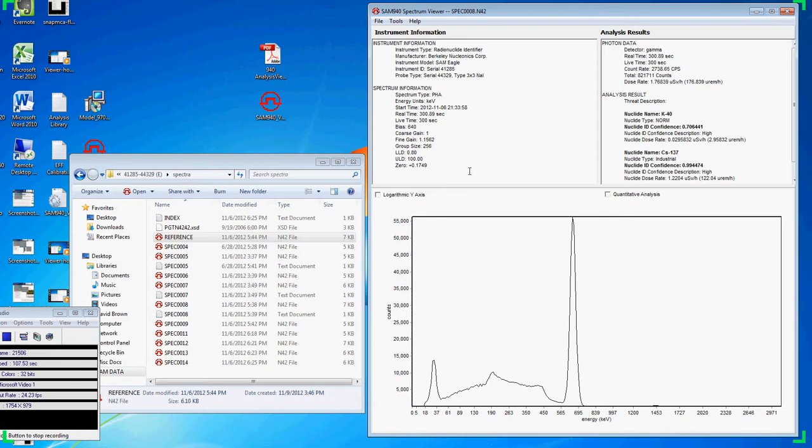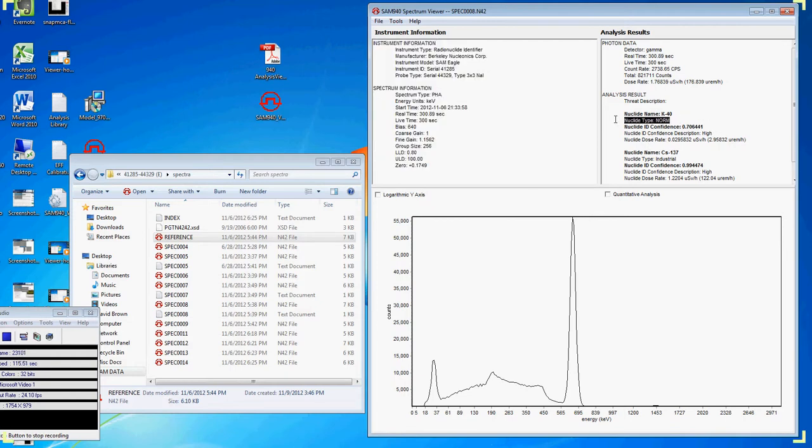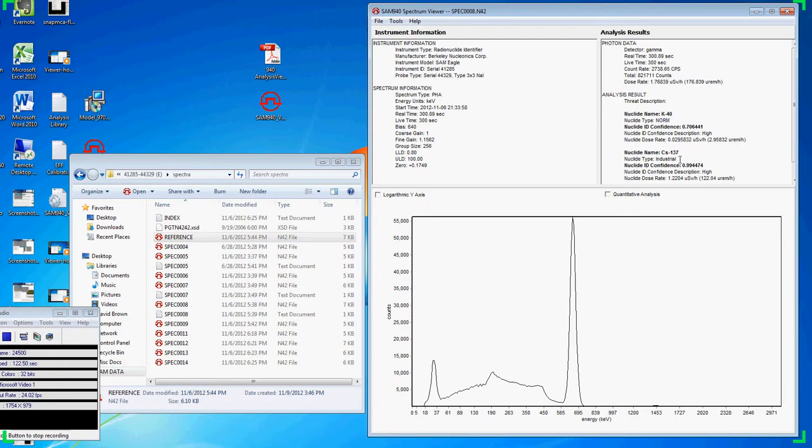Note the instrument panel is on the left and the analysis data is on the right. The isotope identification is included in the analysis data. The isotope class is also included with the isotope. In this example, we've identified potassium K-40 and cesium-137.